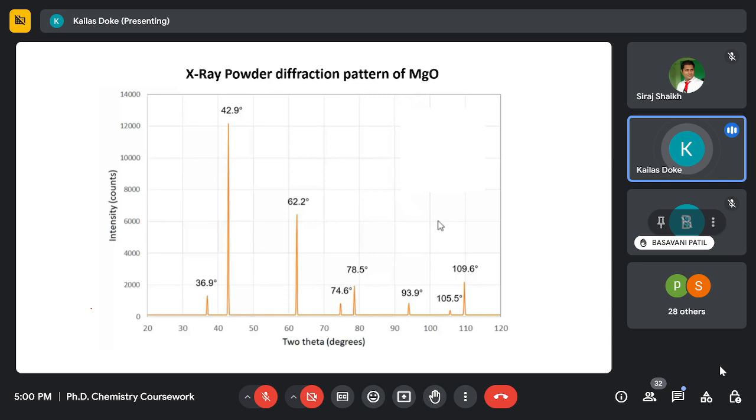From that, confirm what type of sequence is there, confirm FCC, BCC or simple cubic lattice, and then find out the a values. You cannot find the d values because it requires the wavelength. So till the a values, the lattice constant, you can do the calculation and submit this as an assignment.